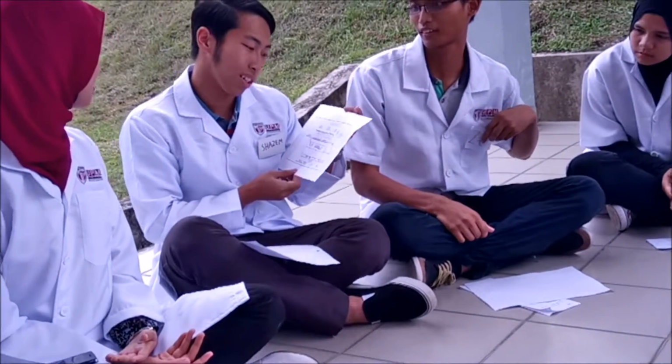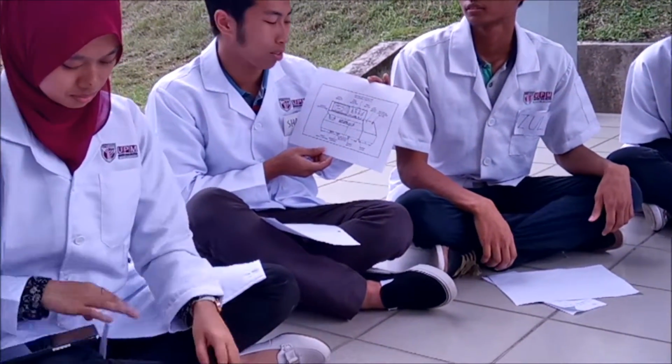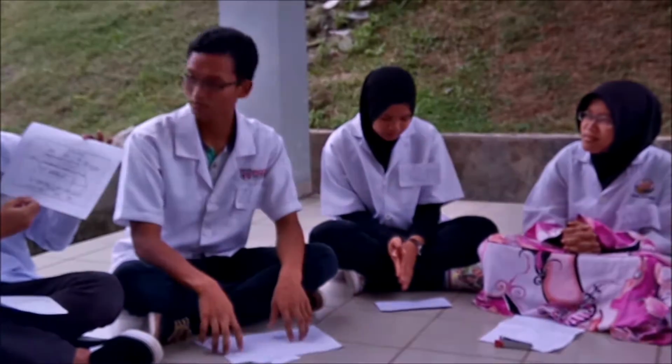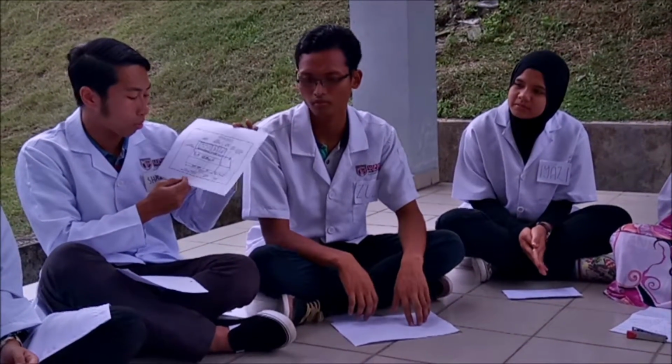And the sixth one is the lamp power switch, to switch on the lamp, the light source of the spectrophotometer. And this is the mirror level, to adjust the mirror level or the lens level in the spectrophotometer. And the power switch, most important, to turn on the power supply of the spectrophotometer.